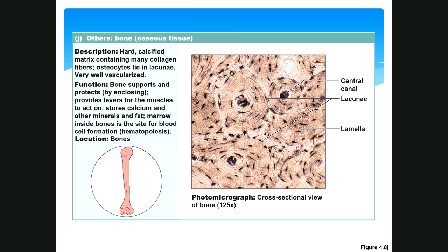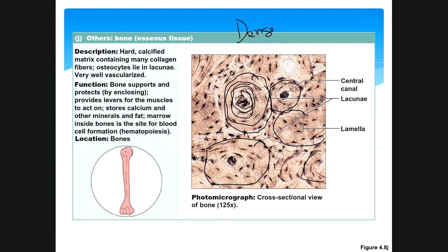And if you look at it, it looks like someone cut a bunch of trees down, and there's a stump, and another stump, and another stump. It's got rings, like rings on a tree. They go in a circle like this, just like the rings on a tree. And then it looks like there's a whole bunch of bugs crawling around on it.